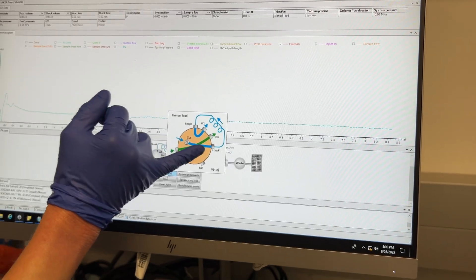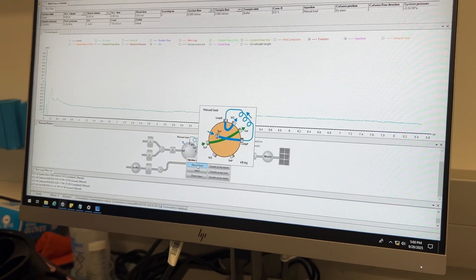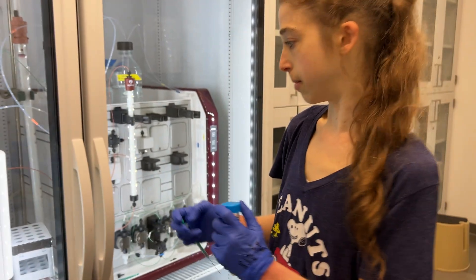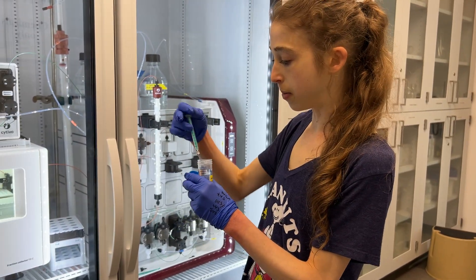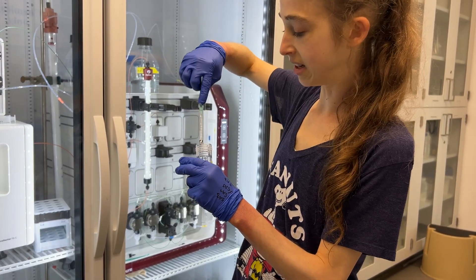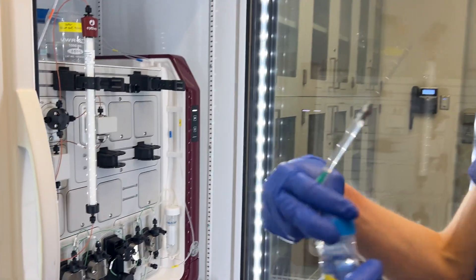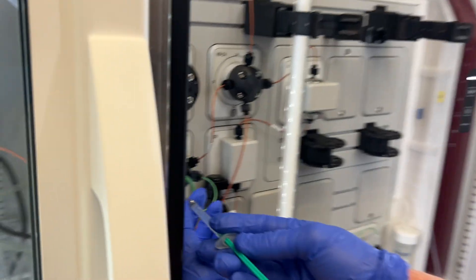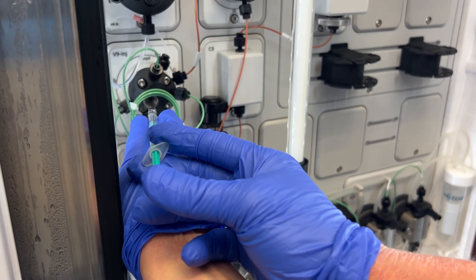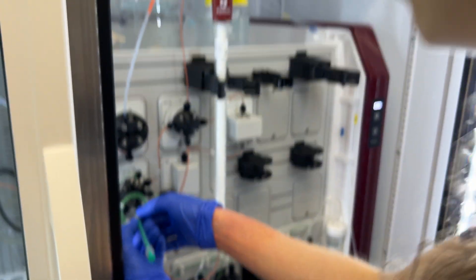So we should be pushing in about a mil through here — about half of it should stay in the loop and half should go out. We're going to do this with water, then with buffer, and then we'll be ready for our sample. We're just going to draw up a little over a mil. Then I'm just going to inject this into the loop, going straight into the port, and gently push. You don't want to apply too much pressure, but it should go easily. If it's not going easily or you feel something jam, that's an indicator something's wrong.